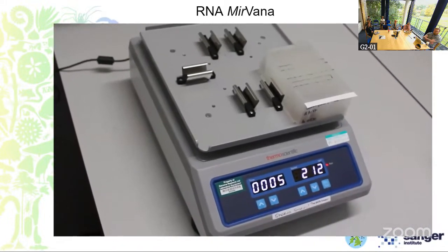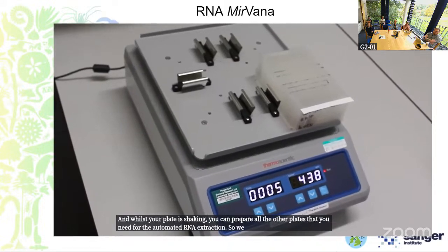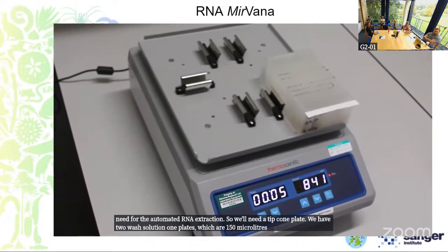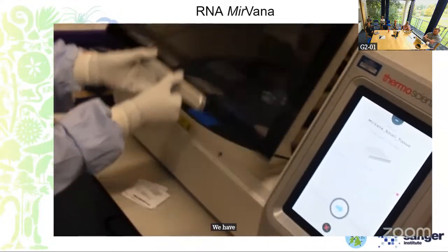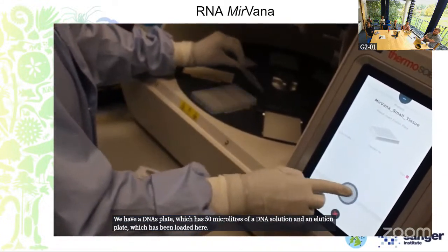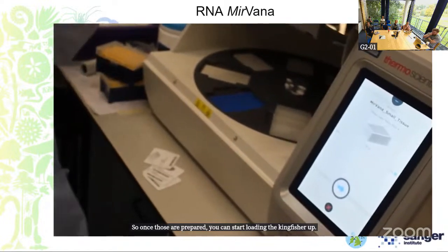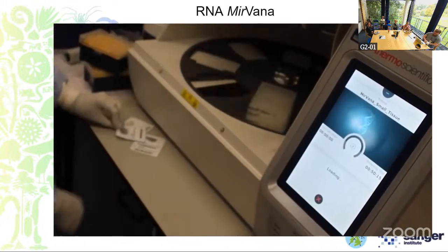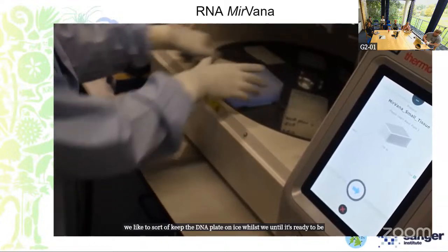And whilst your plate is shaking, you can prepare all the other plates that you need for the automated RNA extraction. So we'll need a tip cone plate. We have 2 wash solution 1 plates, which have 150 microliters of that in each. 2 wash solution 2 plates, again, which is 150 microliters. We have a DNase plate, which has 50 microliters of a DNase solution, and an elution plate, which is being loaded here, which is 50 microliters of elution. So once those are prepared, you can start loading the Kingfisher up. And we like to keep the DNase plate on ice until it's ready to be loaded into the Kingfisher as well.